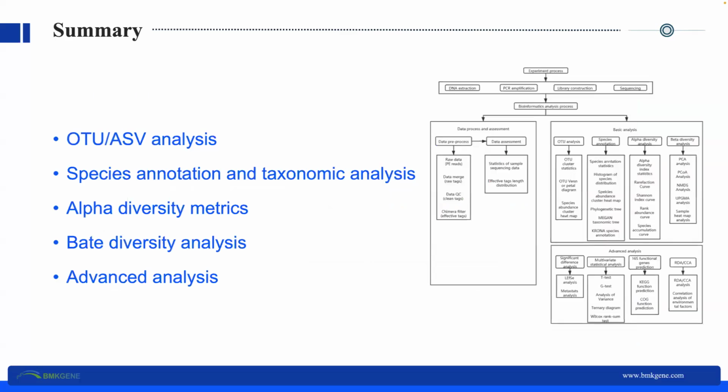Let's summarize here. We went through the whole results quickly, and you can see BMKCloud provides most of your needs. I just showed a small part of the whole results, and I suggest that you try BMKCloud yourself, using demo data or your own data, and check the report. The demo data analysis is free.